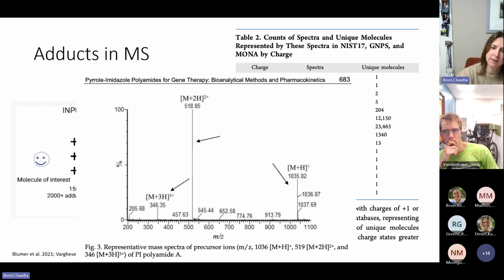So that's what this is showing here, either positively charged or negatively charged. Most of the molecules are showing up that way. And then there's a handful that have 2 or 3 or minus 2 or 3, and only very few that have a whole bunch. This is not true for proteins, say, but for small molecules, this is true. And what that looks like in a spectrum here is your mass to charge ratio. So you're not only seeing adducts, but you need to divide the mass by the number of charges.